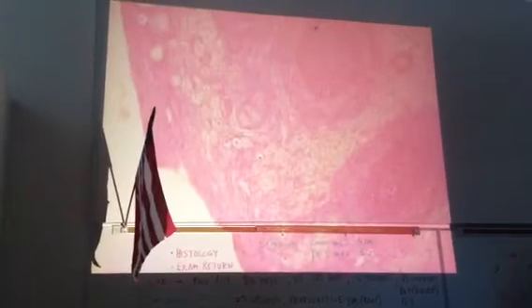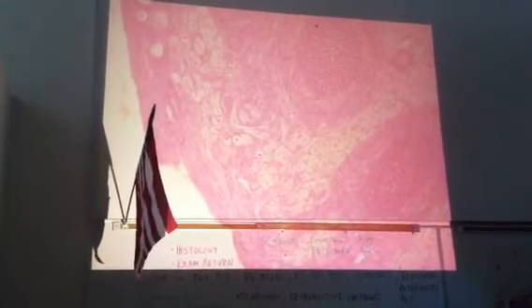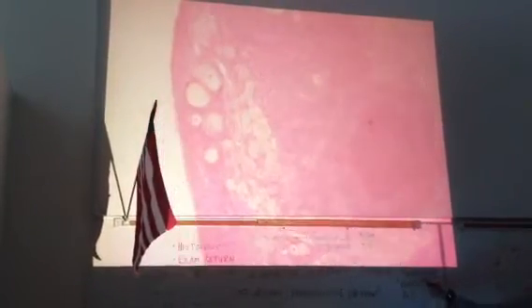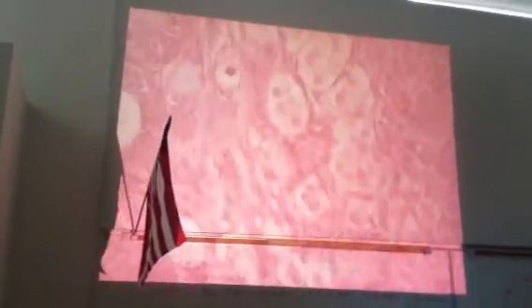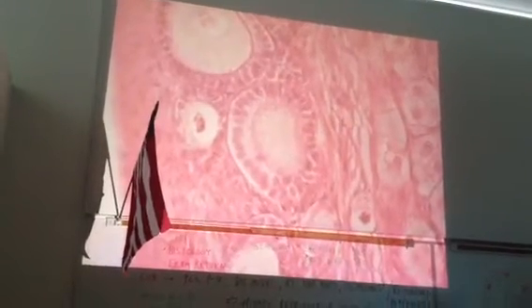So they become a primary follicle, and the primary follicle looks almost oval with a bunch of columnar cells around it. So there are 3 of them right there. That's a primary follicle. Okay, so here's one right here.